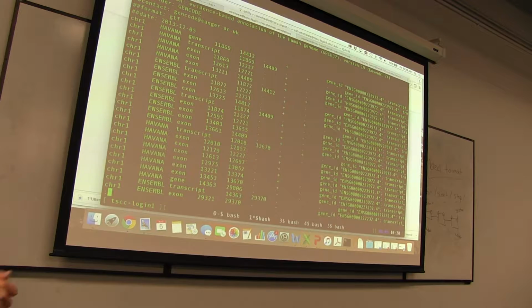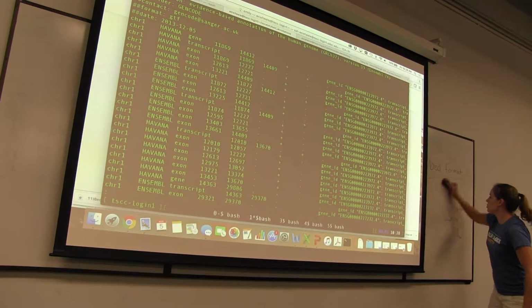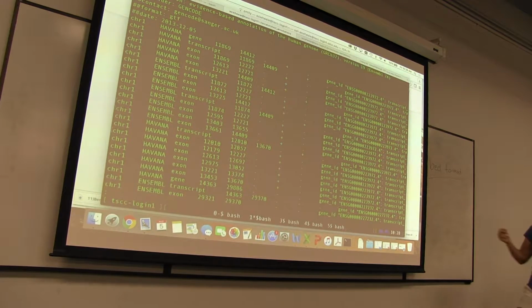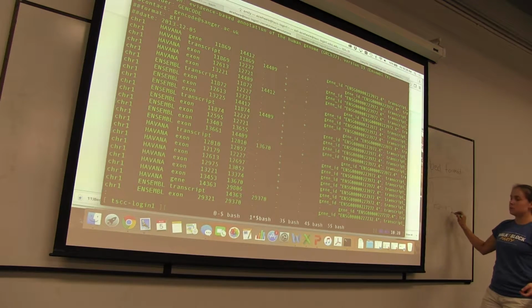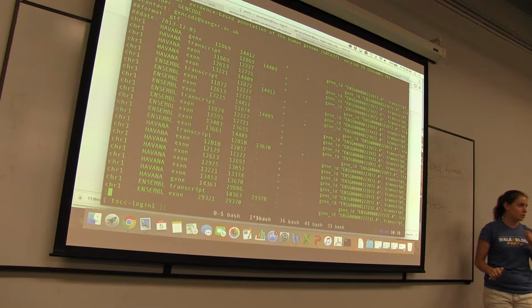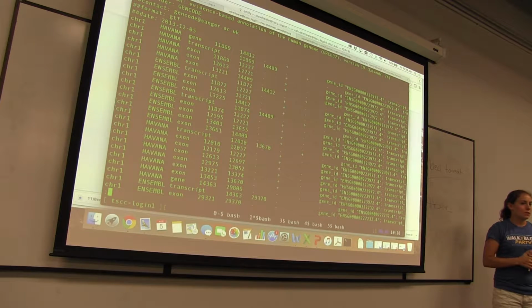The other way that you define regions in BED format is for binding data. With binding data, when you do these ChIP-seq and other seq experiments, are you familiar with seeing these figures where they show a peak of all of these reads upstream of a gene? This would represent where a particular transcription factor is binding to the genome. Are you familiar with seeing stuff like this in papers? People are not as much.